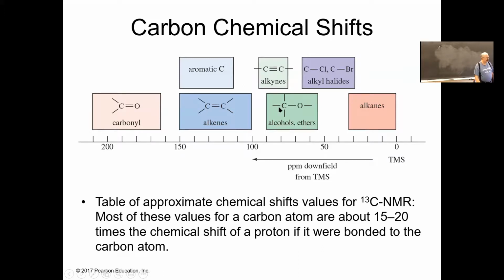So will alkynes. Alkenes and aromatics will show up usually about 110 to 150. Carbonyls, about 160 to 210. And within that, we can distinguish among the different types of carbonyl compounds based on where they are in this range. Esters will typically be at the lower end, whereas aldehydes and ketones will be at the higher end.